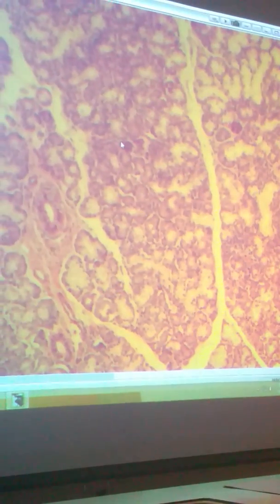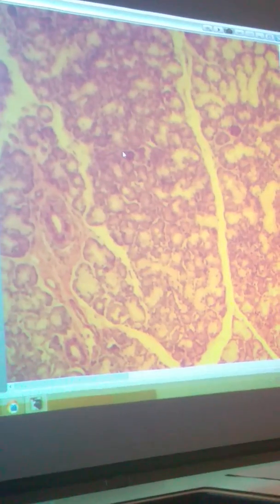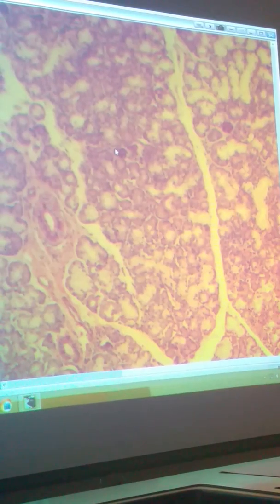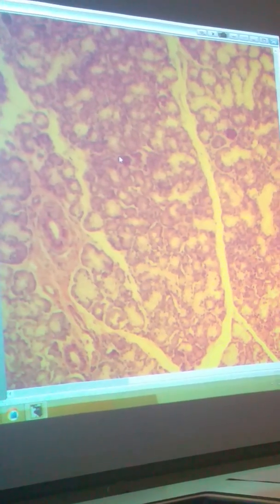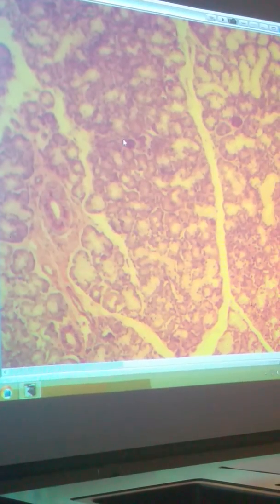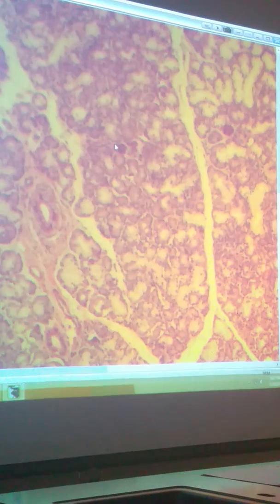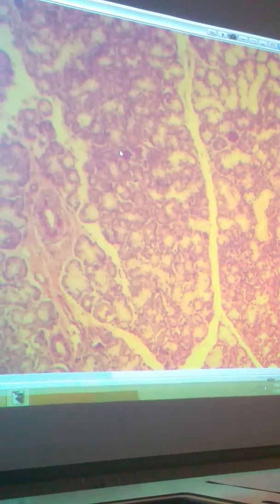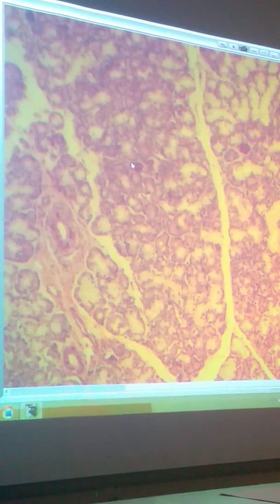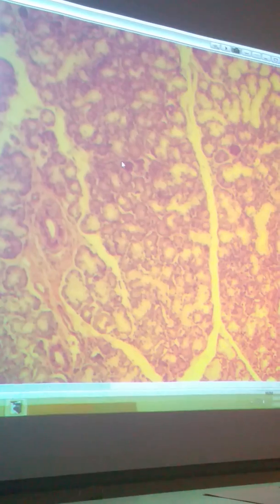Sublingual, okay. I can see all the mucus, right? So again, in the submandibular, you'll see a combination of both. Does that make sense? Will you guys be able to get that on the test? Definitely. If I put one on the test this Monday, you guys will get it, right? I'm putting up like 10 microscopes, nothing else, because you already did the anatomy part of it.